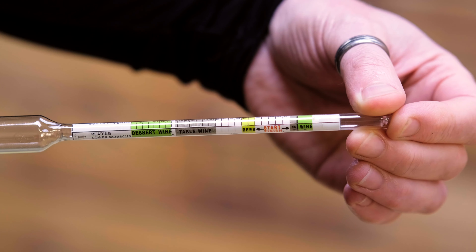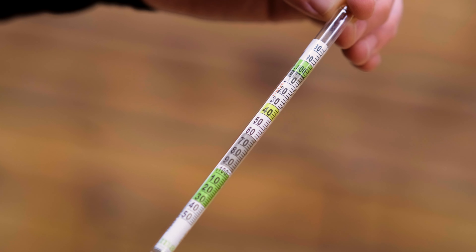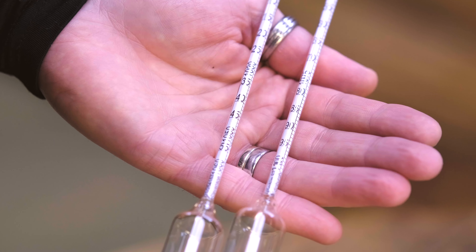Let's take a look at traditional glass hydrometers. These can be specifically for wine, for beer, for spirits, or we can actually get ones that have a triple scale that will read all three. In actual use, what we find is the less information on the hydrometer, the easier it is to read a correct reading. At the cheaper end of the market, they tend to have a lot more information on them and the scale tends to be a lot wider, meaning there's an awful lot of information and just a tiny amount of difference in height on the hydrometer makes a huge difference in the reading.